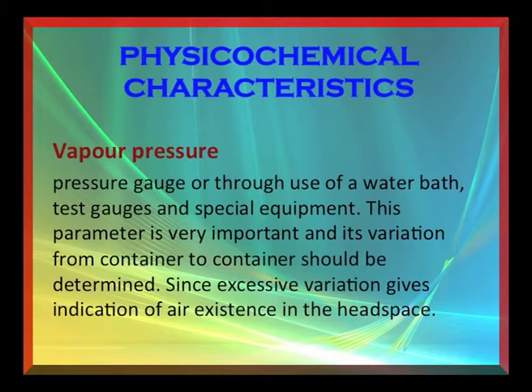This parameter is very important and its variation from container to container should be determined, since excessive variation gives indication of air existence in the head space. For accurate measurement, a puncturing device can also be used.